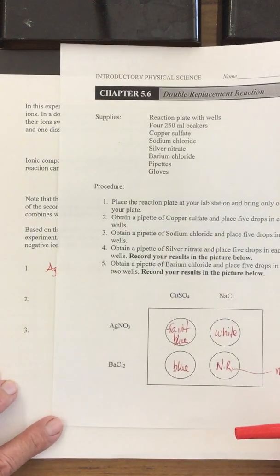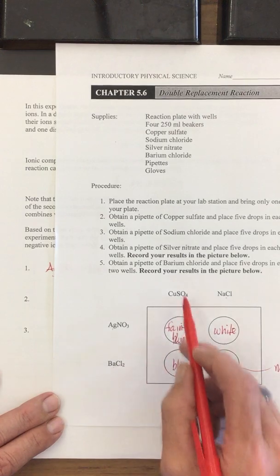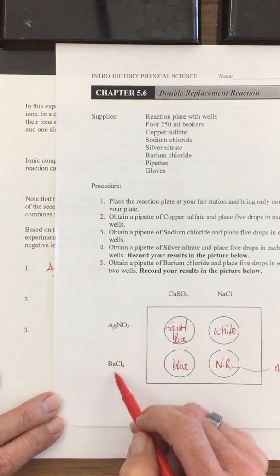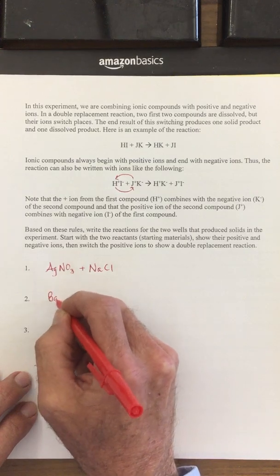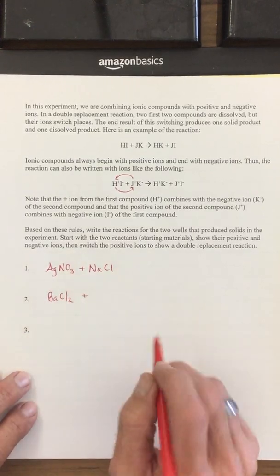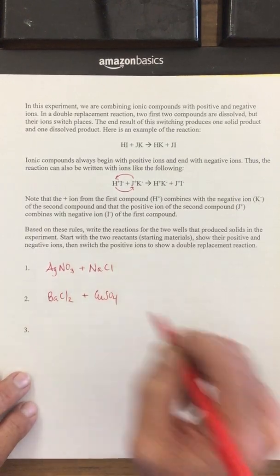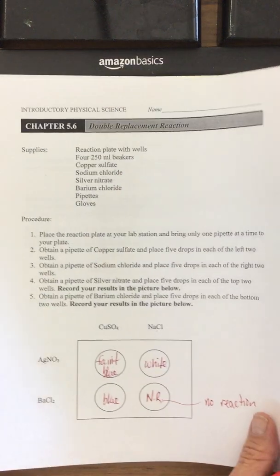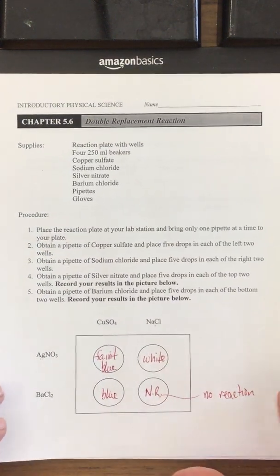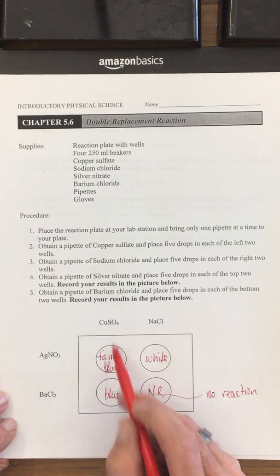The second reaction that we're going to be looking at is combining the barium chloride and the copper sulfate. So it's BaCl2, and we're going to be combining this with CuSO4. The third one is going to be combining the AgNO3 and the copper sulfate right here.